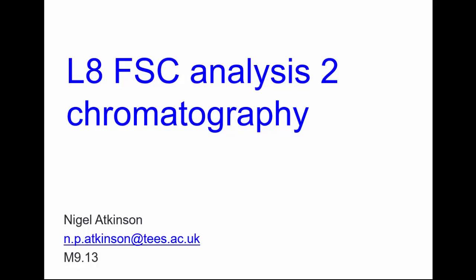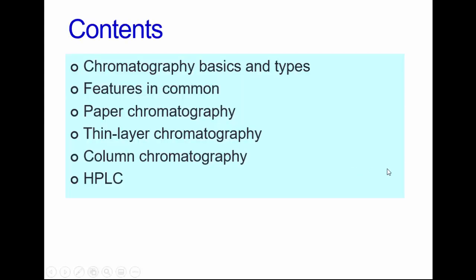Okay, Food Science and Chemistry Lecture 78, beg your pardon, Lecture 8. Chromatography. Looking at some chromatography techniques. We'll look at general characteristics, paper chromatography, TLC, column chromatography and HPLC, which some of you have already used, of course, in the lab.